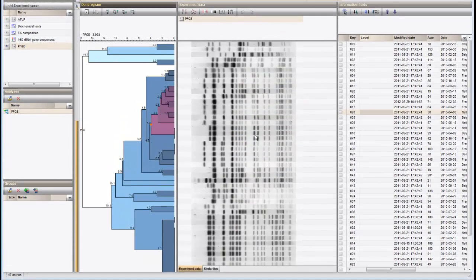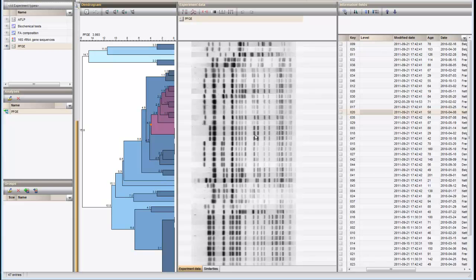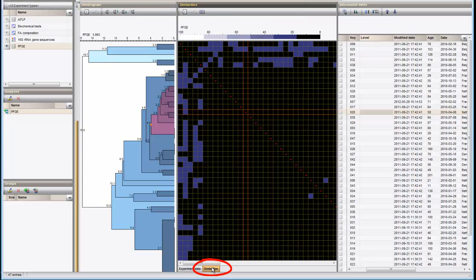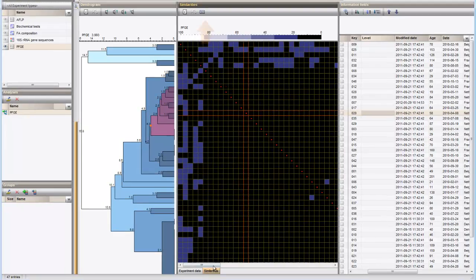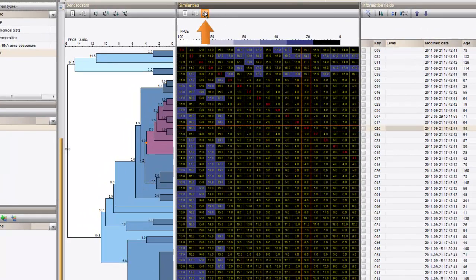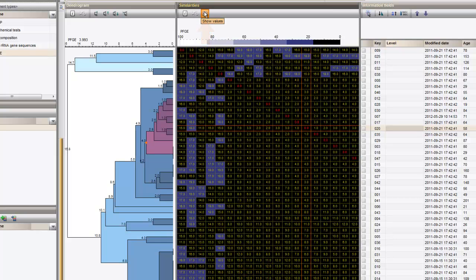Now, if I want to display the distance matrix, I click on the Similarities tab. I can display the distances within the matrix by pressing the button Show values. The shading intervals can be adjusted with the Display settings button.